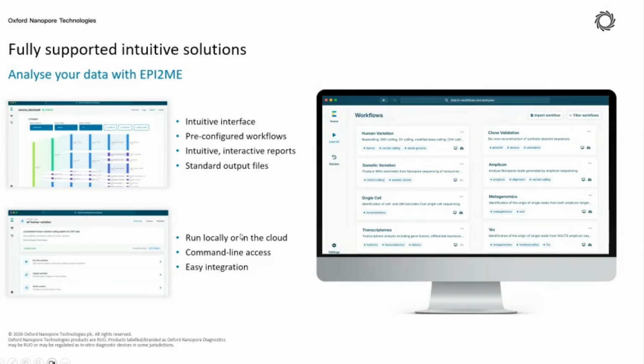ONT also provides a free cloud resource in case the computer that we are using is not powerful enough. But for human whole genome sequencing, because the data involved is human related, and normally human data involves some privacy and confidentiality issues, the cloud resource provided by ONT is not available for analyzing human data. So for human data, we still need our own computer to do the analysis using EPI2ME.